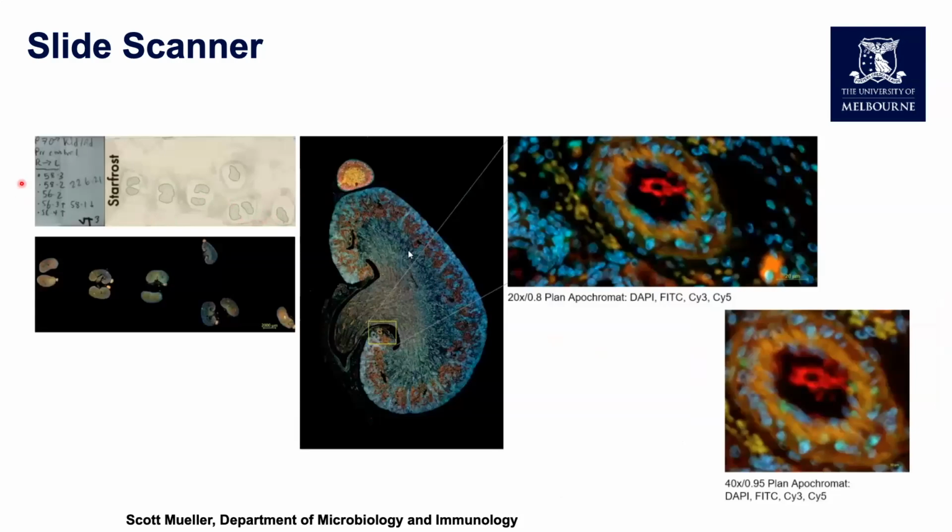In this case, we have our preview scan showing where the tissues are. We can go in and define that. So we can use bright field or fluorescence for that. Here we have a few different examples of an overview scan, the same region at 20x and also at 40x as well. So again, it's not going to get you fantastic subcellular resolution, but if you're trying to count or visualize structures, then this is a much faster way of doing it than doing it manually on an epifluorescence scope or on a confocal microscope.